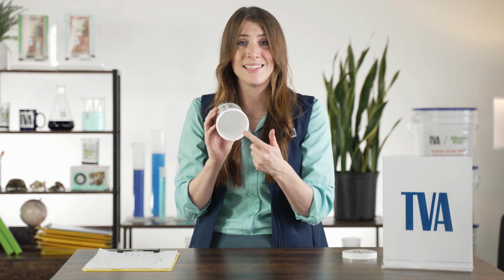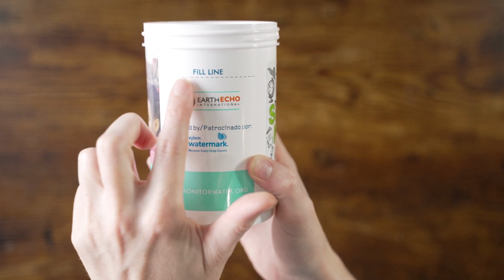Also, in your beaker, if you take your lid off and look in on the inside, there is a black and white circle. This is called a Secchi disc. This Secchi disc is how we will measure our turbidity, which has to do with the clarity of the water. It's a really important piece of science equipment, but it's very simple. Also on your beaker, you should have a dotted fill line. When we fill up our beaker full of water, we will fill it up till it's approximately at the fill line, and then we'll put the lid back on so we can continue the rest of our tests.